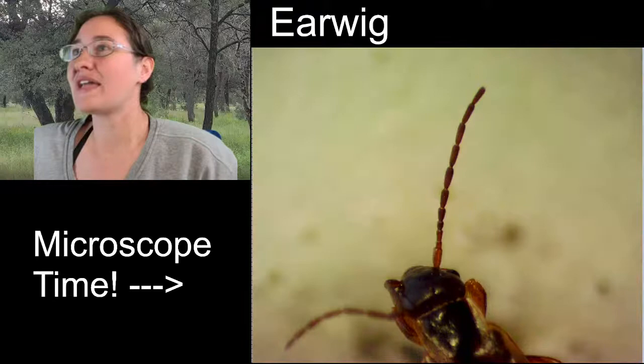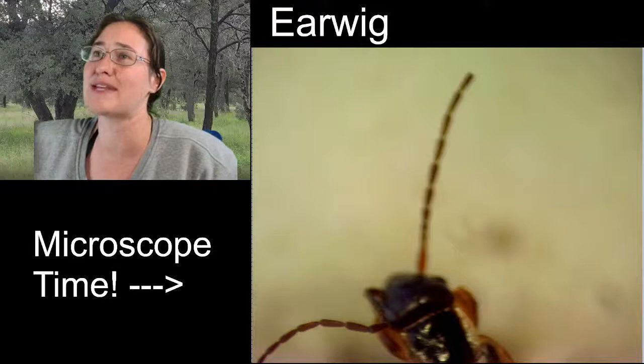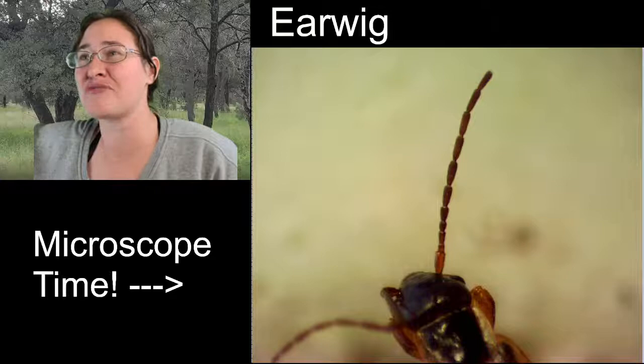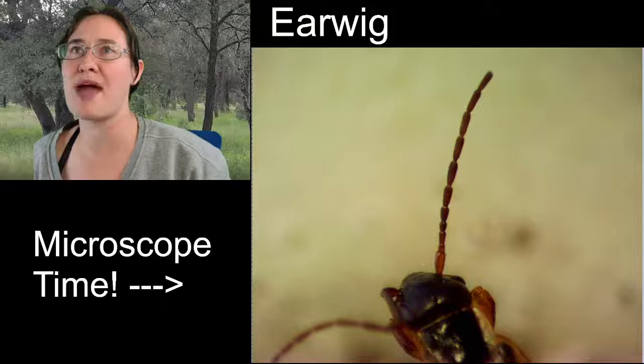Can we get a closer look at the mites too? Yes, we can get a closer look at the mites. I do want to get the antenna sketched first, and then we'll go ahead and go back and zoom in on those mites. Although, those mites may be kind of at the edge of my microscope's ability. I don't have another lens to get any closer than where I'm at. Alrighty.